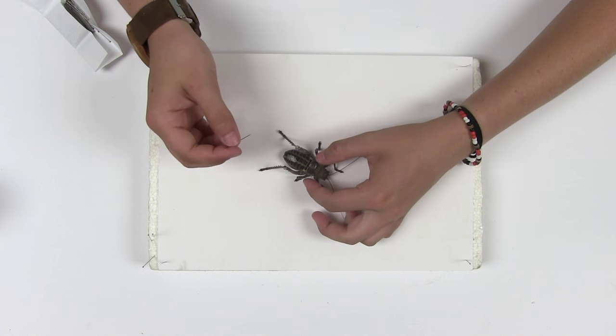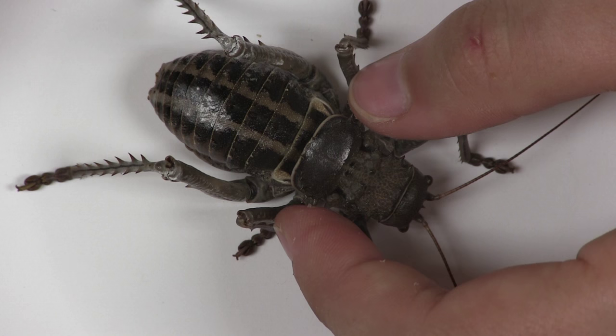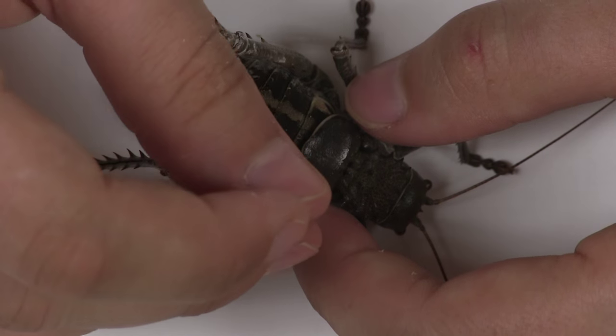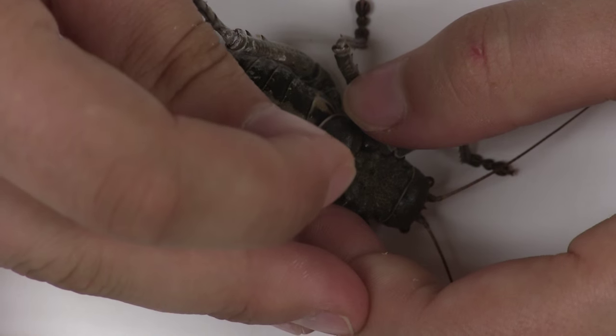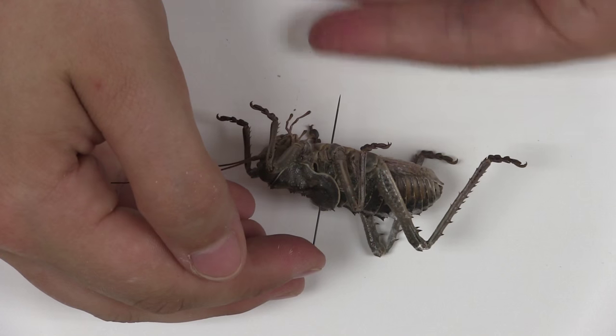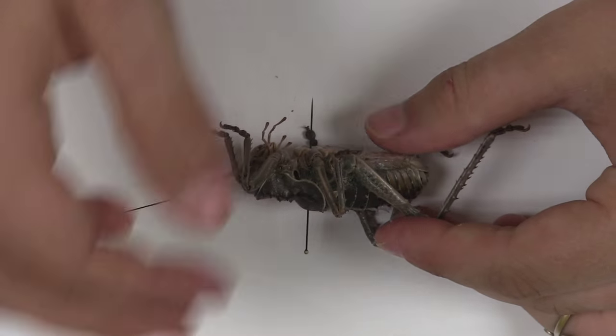Now you are ready to pin your specimen. Hold the insect firmly and insert a number four, five or six insect pin through the right-hand, posterior side of the pronotum. Check that the pin has gone in straight. The specimen should be perpendicular to the pin and one centimeter from the top.